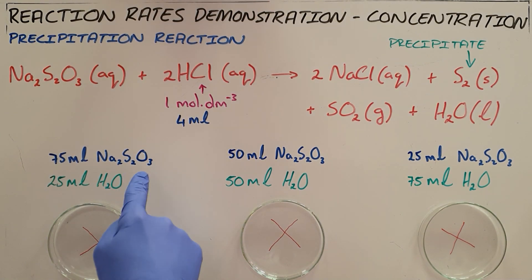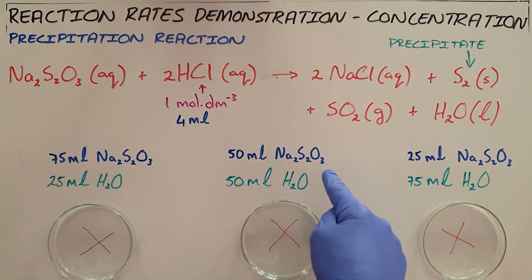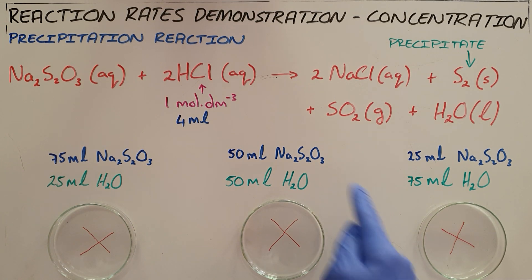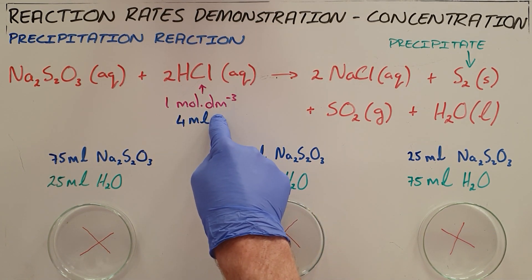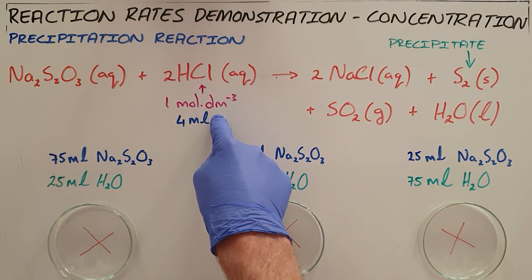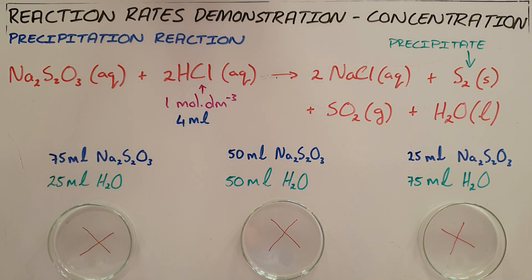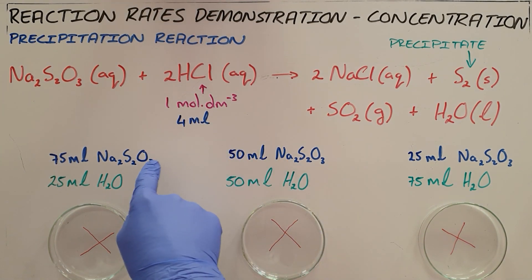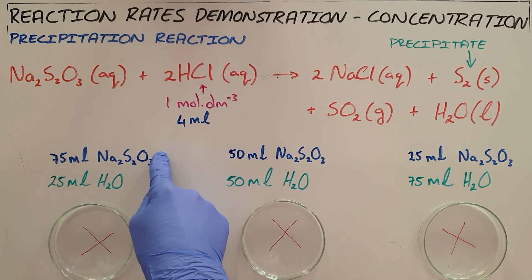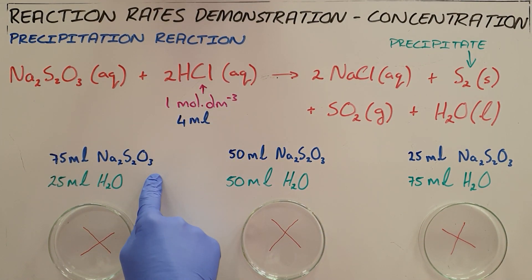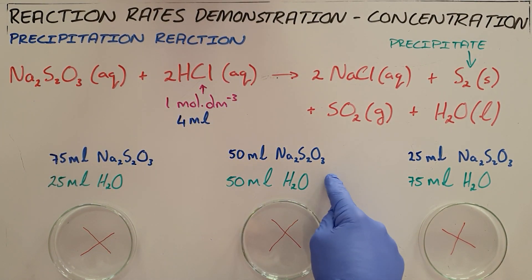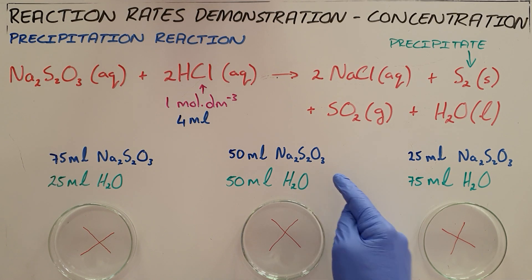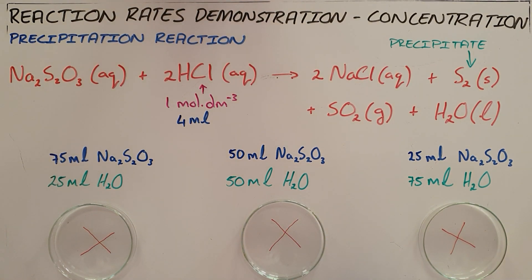What we've got is different dilutions of our sodium thiosulfate. The concentration and quantity of hydrochloric acid remains constant, and so we're going to see what effect changing the concentration or the dilution of sodium thiosulfate has on the rate at which this reaction proceeds.